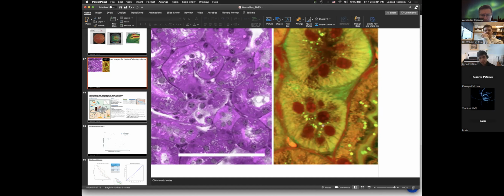So then you could ask questions like, do you have cell death within tubules of certain type? Perhaps with age or disease, some cells are dying, or lipid is moving into some cells but not others. Maybe there's increased heterogeneity of protein and lipid within the cells of certain tubules.